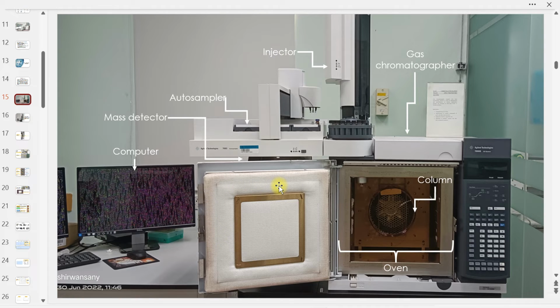Cuma beza TOF dengan MS tu sendiri ialah TOF MS tu dia lain sikit dia punya detector lah. They have time of flight mass. Theoretically, GC TOF MS lebih sensitif, more sensitive daripada GCMS, the one that we run this morning. Unfortunately, in HUD we found inversely proportional, terbalik.